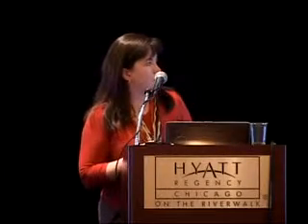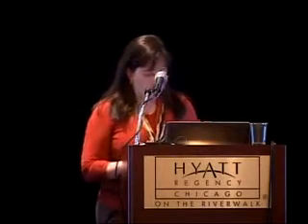You're going to do some homework on what you're going to need as part of this system. Hopefully you've done that during the system selection process, but if you haven't, we're going to talk about some of the things that you need to look at prior to getting the contract in your hands. These are things that you need to communicate to the vendor to make sure that they're starting out with a fair baseline. Other things is that when you get the contract, you need to check the items you've received for review. You need to review the contract, and then you need to provide your feedback to your attorney, not to the company's attorneys, not to anybody else's attorneys, not to the company, to your attorney. And then you let your attorney handle the negotiations.